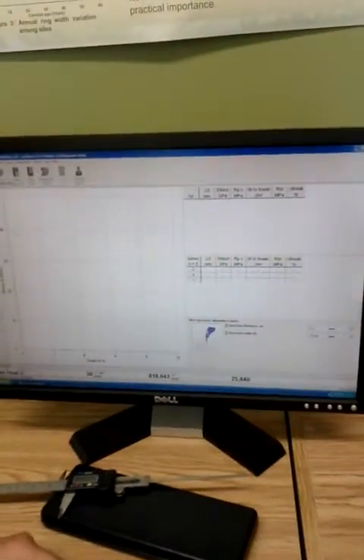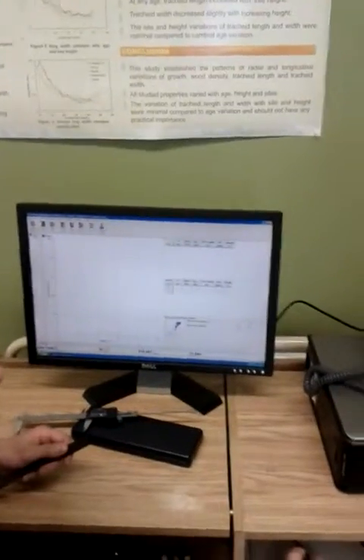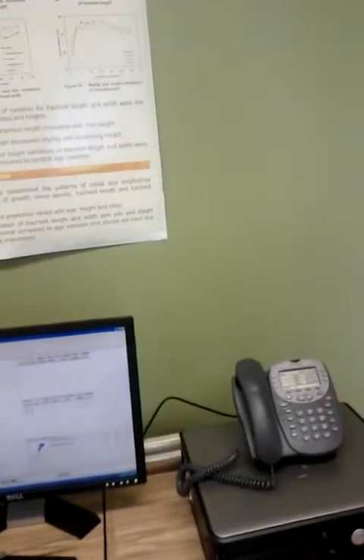Then when I click LE, it will go to 115. So just move away. It should be fine. So I will test. If it goes in the wrong direction, or if something goes wrong, you can press stop.